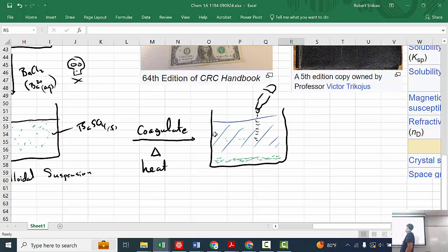If this is done, I'm going to let it cool down a little bit, cover it with a watch glass so nothing falls in, and then put it in my equipment drawer. I'm going to collect them next time. Or put them in the cabinet over here if you don't have enough room in your equipment drawer. This is a multi-day experiment, so this is as far as we're going to get today.